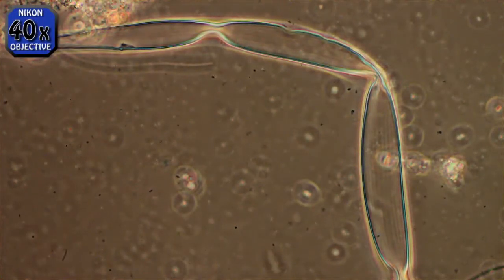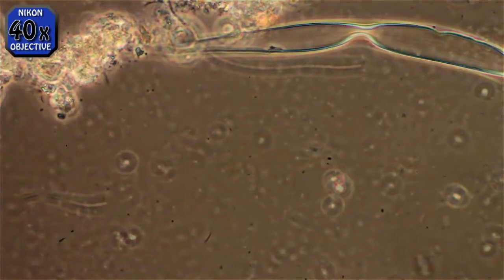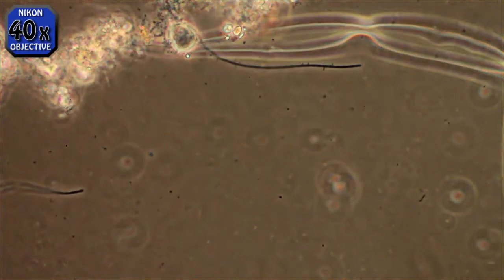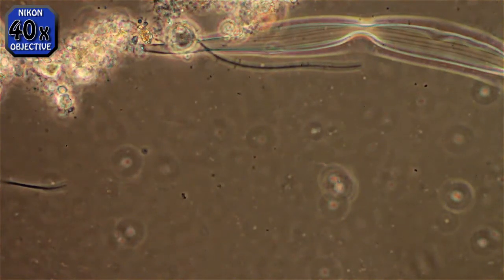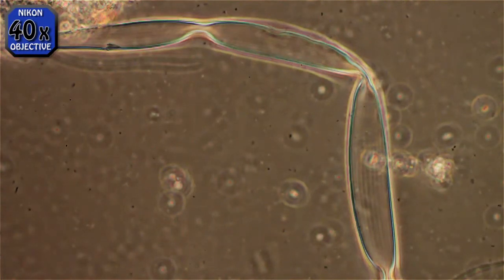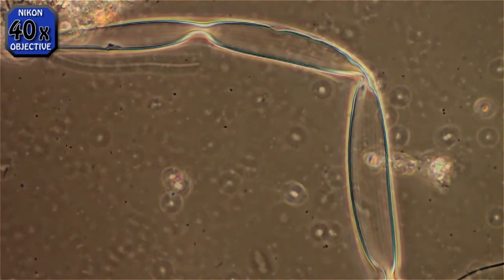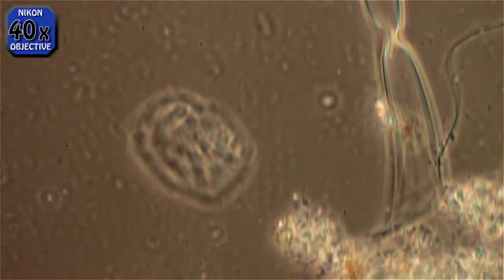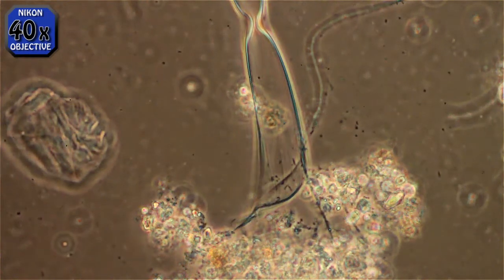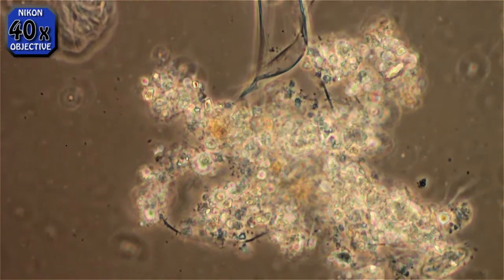We're going to 40x right here. The blue color is an artifact of the phase shift, I guess. I don't pretend to understand how they work, I just know that they do. Normally you see all these little blue particles — you would never see those looking through bright field, but the phase contrast brings them out.